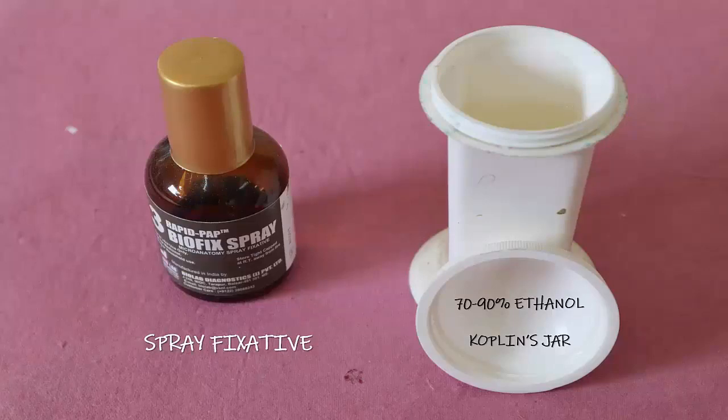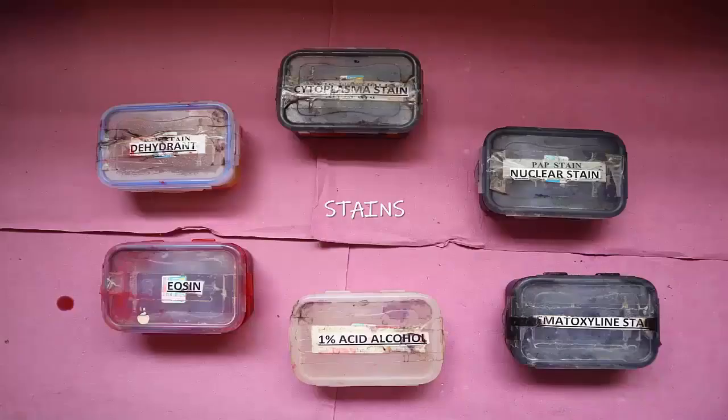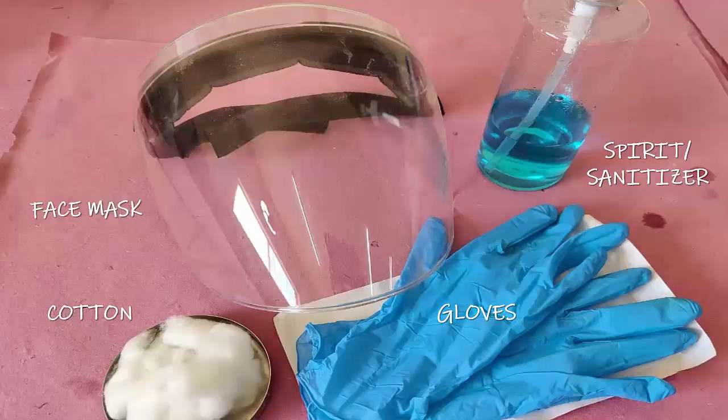Other fixatives like Carnoy's fixative for lysing red blood cells or glutaraldehyde and 10% buffered formalin should be available if tissue fragments for EM or for paraffin embedding are obtained. Stains. We will discuss this shortly. Other miscellaneous instruments include skin disinfectant swabs, sterile dressings, local anesthetic if needed, but most importantly, latex gloves and face masks are required for safety reasons. A small hair dryer is useful for drying smears for Giemsa.